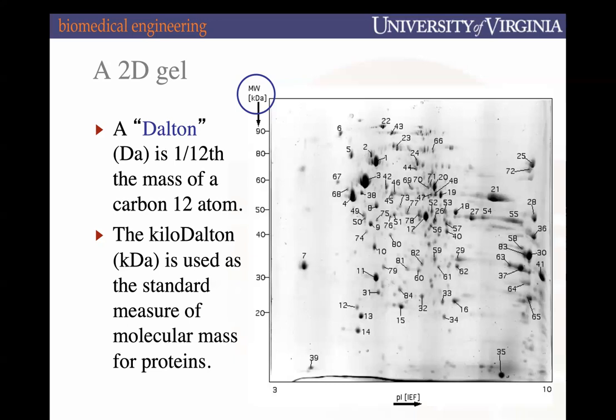You had it correct. Those are examples of why you might see smears. It's not exclusively glycosylation or phosphorylation. One possible explanation for samples 3 and 4, why there appears to be a vertical smear, might be glycosylation events. It could be other things, because we don't know specifically what protein that is. Typically in biology, certain proteins might have certain modifications, and we don't know what the modifications are on that protein, but one possible explanation is that those could be heavily glycosylated, or some of them might be.